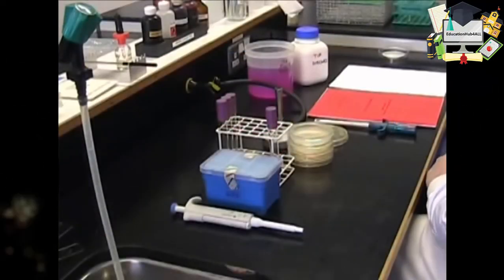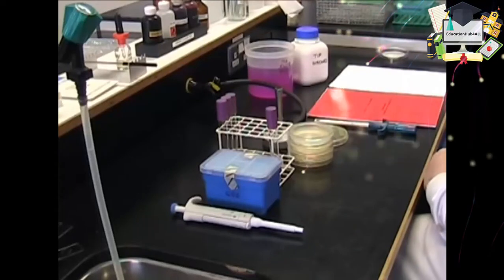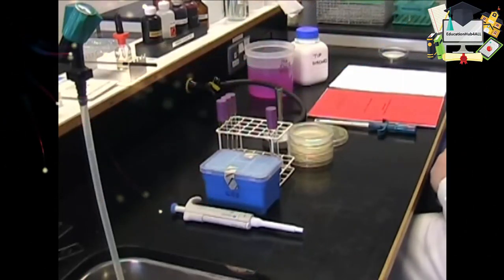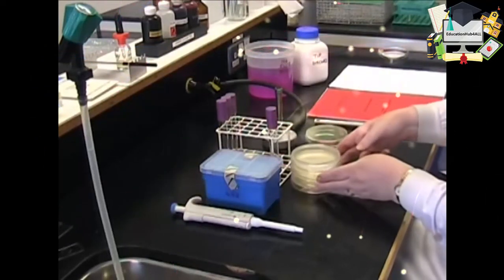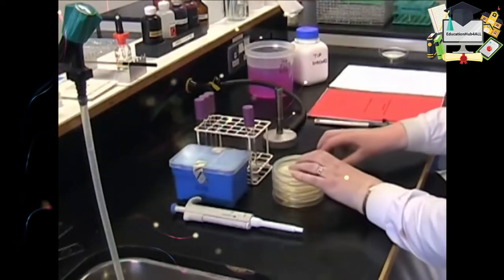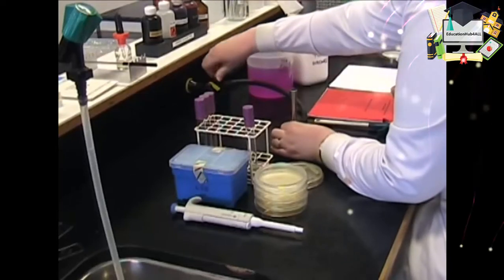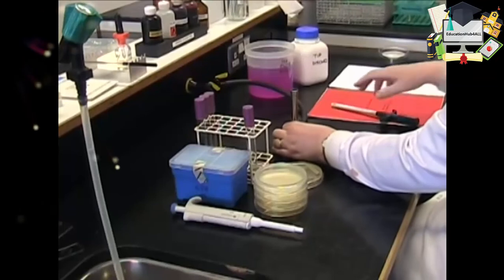When doing your practical, it's very important to work in the correct manner. The use of aseptic technique not only protects you and your fellow workers, but also your work. So the first thing we're going to do is light the Bunsen burner, which provides you an area of sterile working space. So move your items if you need to clear a space around your Bunsen. Turn on the gas, close the air hole and light it with the lighter provided.